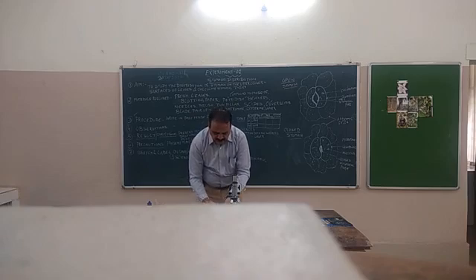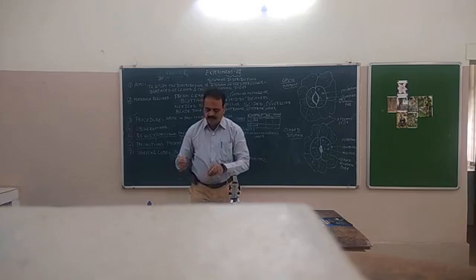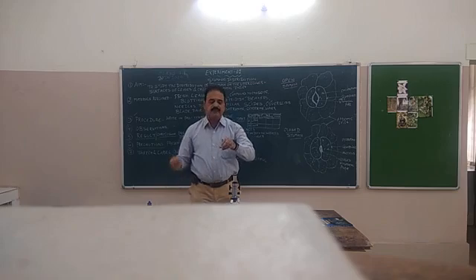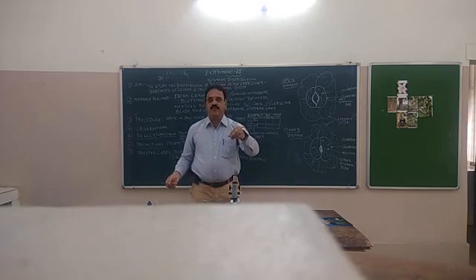And after separating it, with the help of a brush, you put it in the center of the slide. With the help of the brush, hydrate the tissue. Do not dehydrate. This is one of the precautions that you need to take. So put 2 to 3 drops of water so that the tissue will be hydrated.